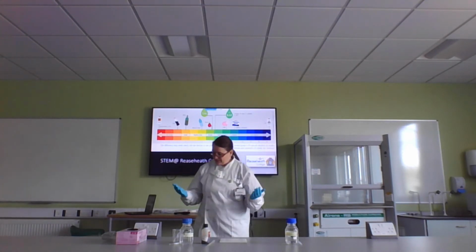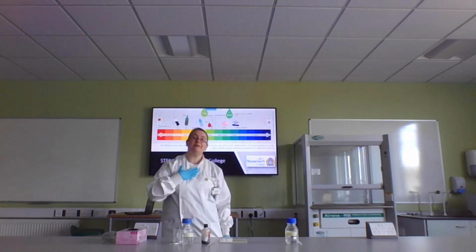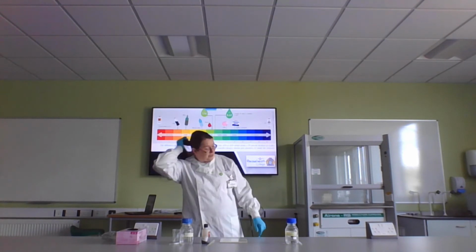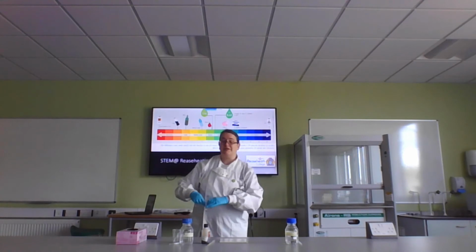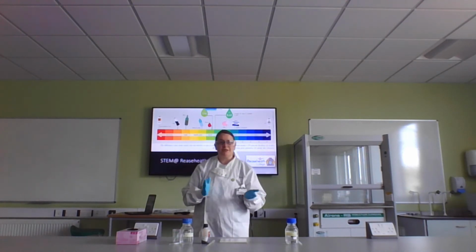I'd like to point out I'm dressed for this. So I have a lab coat on, it's chemically resistant. I'm wearing chemical resistant gloves. I've got my hair tied back, and I'm also now going to put on safety goggles. Needless to say, please don't attempt this at home.